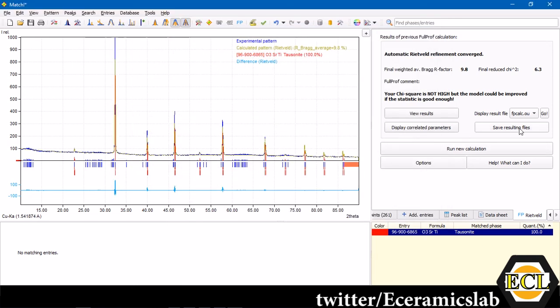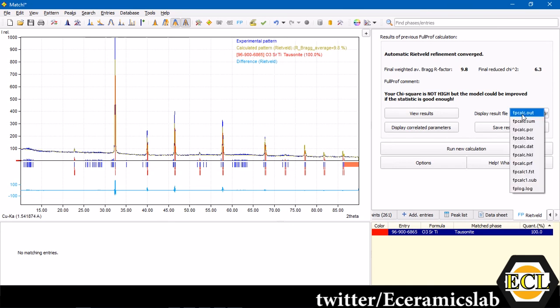You can save the resulting files as well. You can make a folder and save all those files. You will get various files and you can save it.